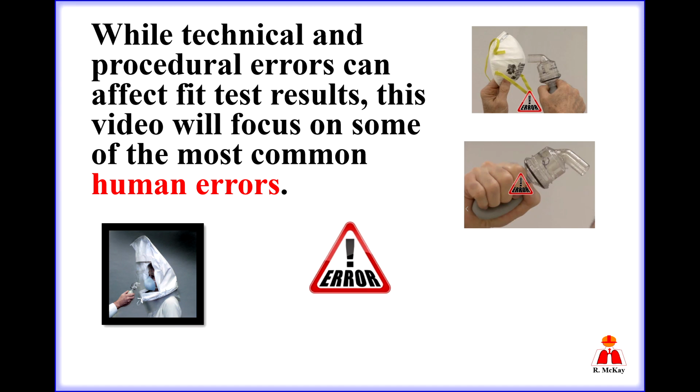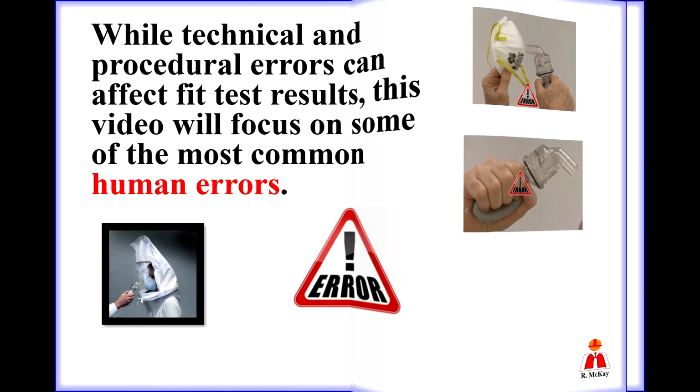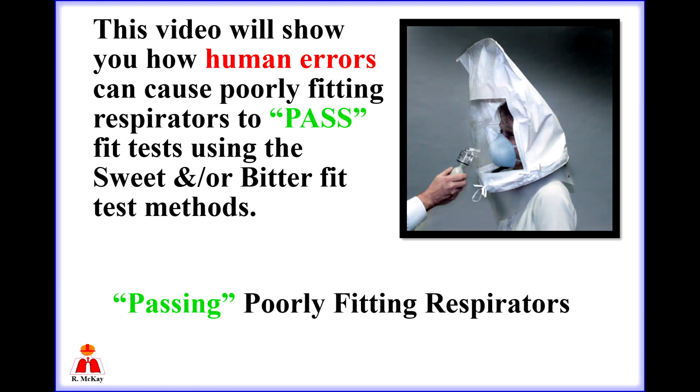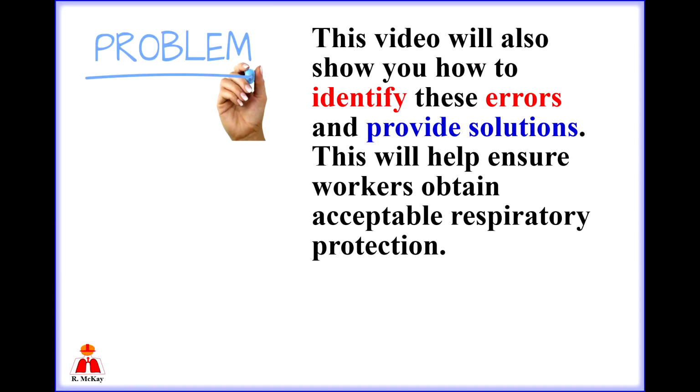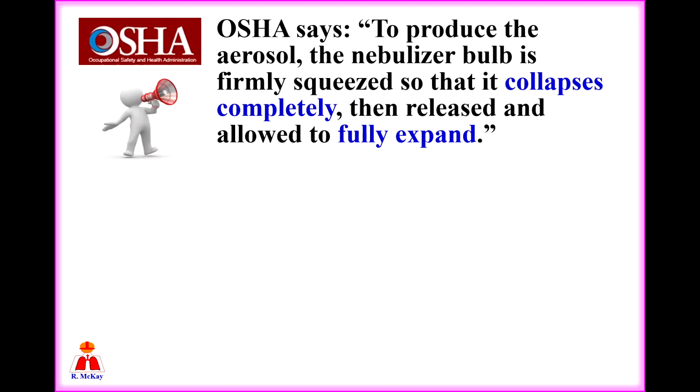While technical and procedural errors can affect fit test results, this video will focus on some of the most common human errors. This video will show you how human errors can cause poorly fitting respirators to pass fit tests using the sweet and/or bitter fit test methods. This video will also show you how to identify these errors and provide solutions. This will help ensure workers obtain acceptable respiratory protection. So, let's begin.